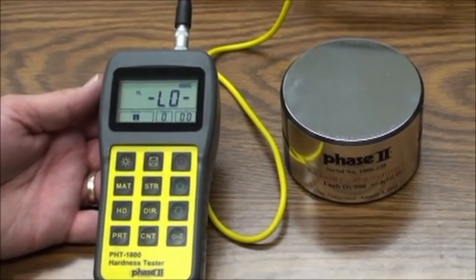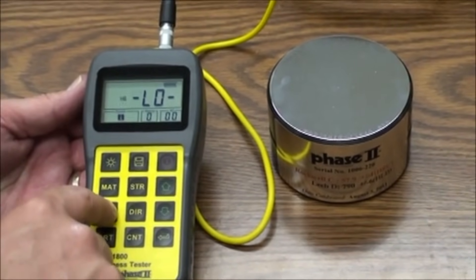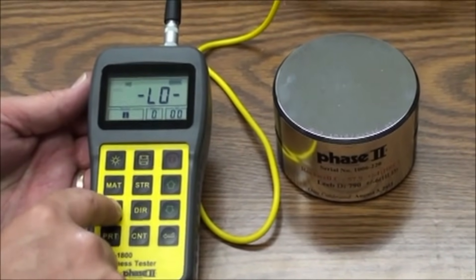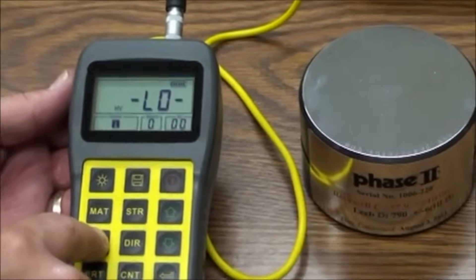Next we go to scale. Pressing the HD button will allow you to toggle through hardness scales of your choice. Please note the scales available are related to the material selected and the probe detected.